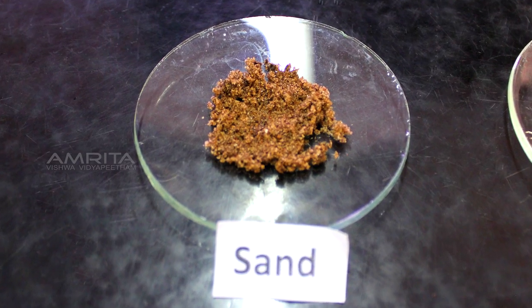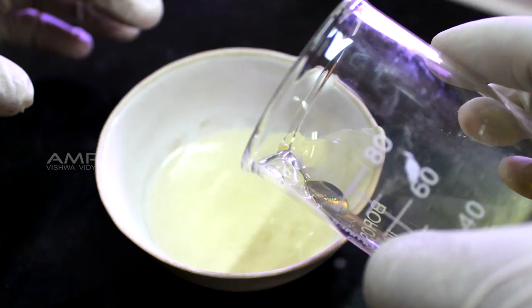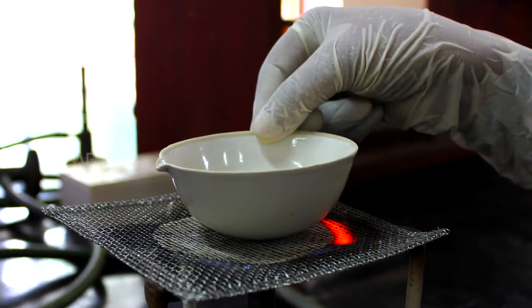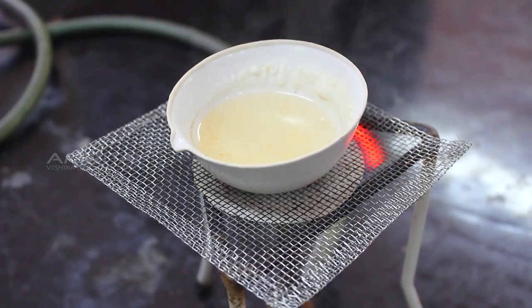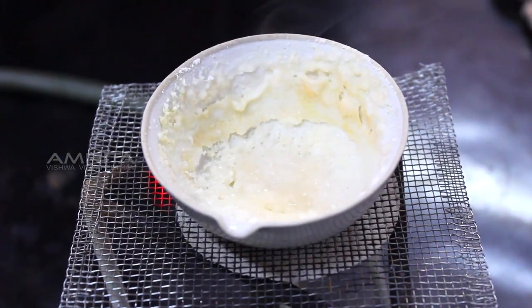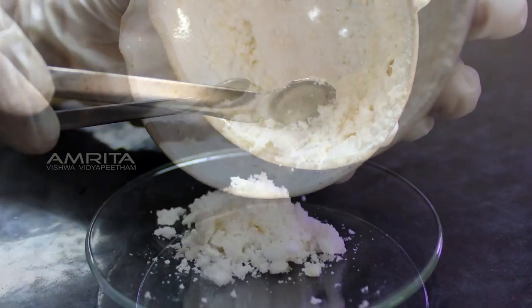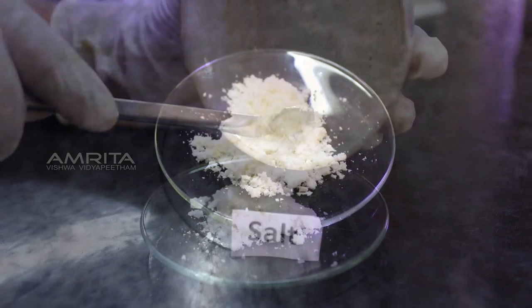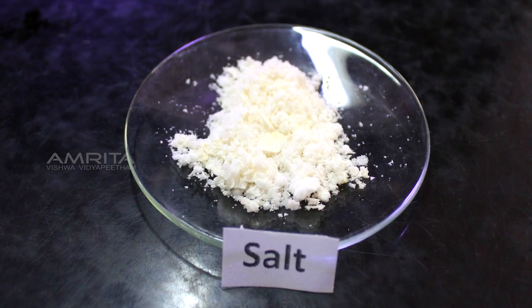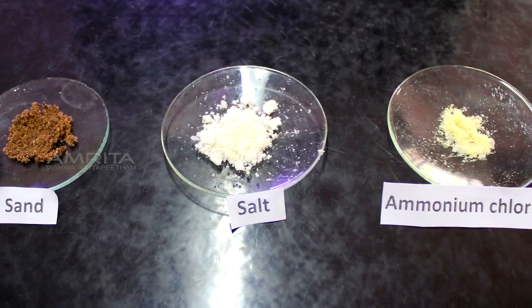into a watch glass. Pour the filtrate from the beaker into a china dish and place the china dish over a burner and allow the solution to boil till the water evaporates and salt is left as a residue in the china dish. Remove the salt from the china dish using a spatula and transfer it into a watch glass. Finally, label the 3 components transferred into the watch glasses.